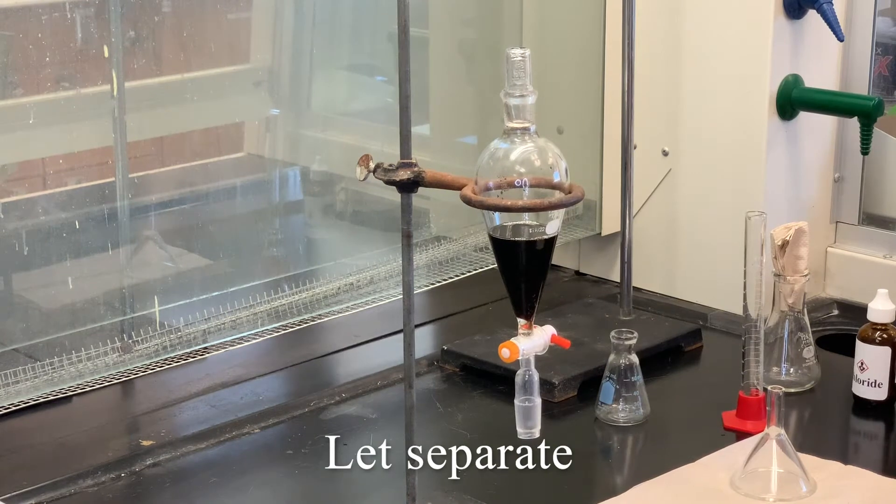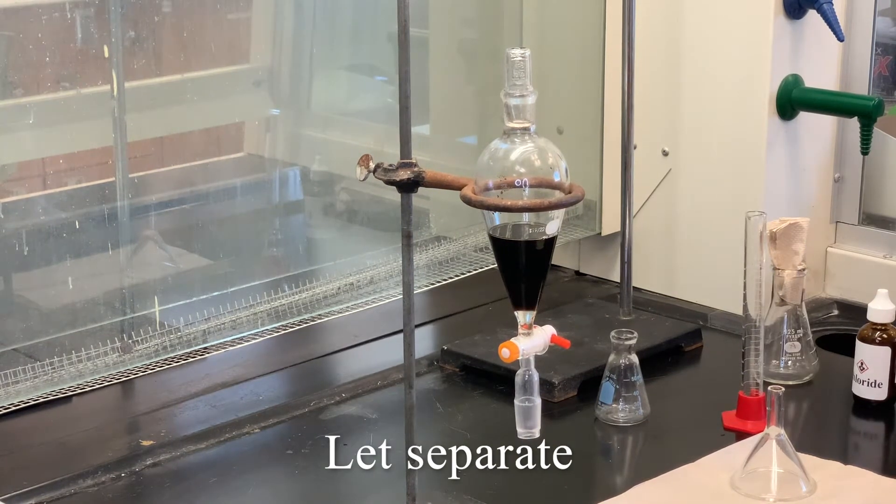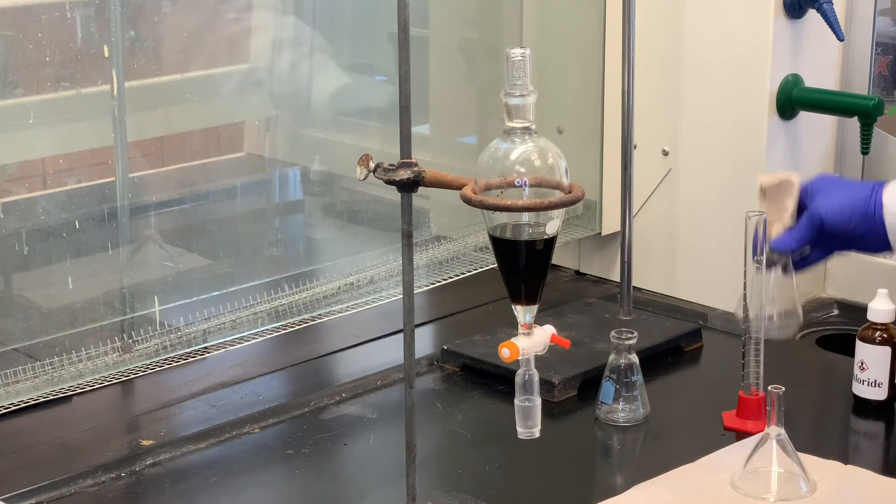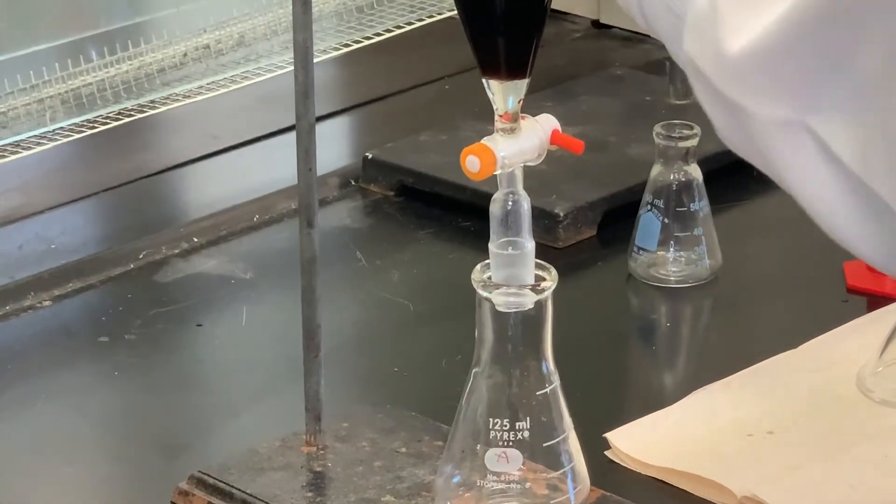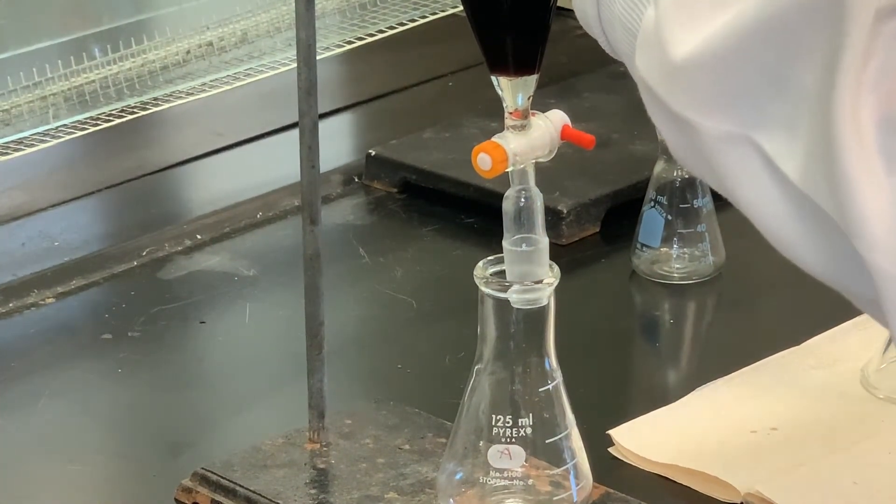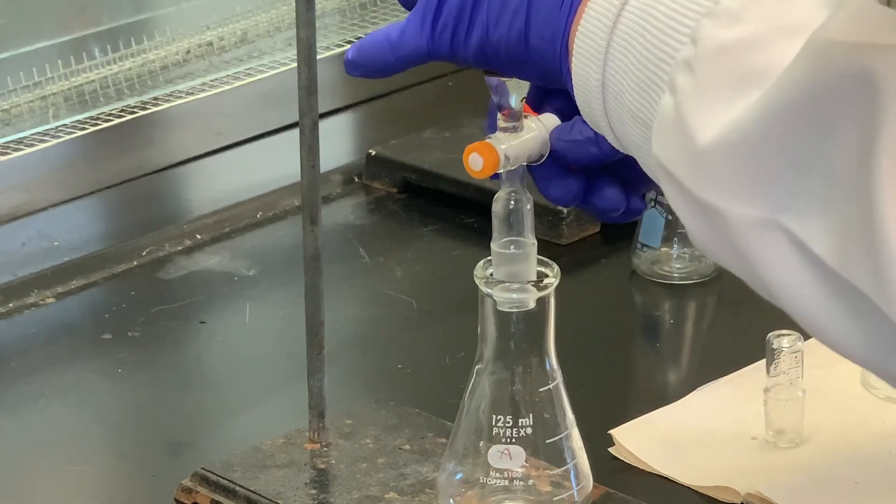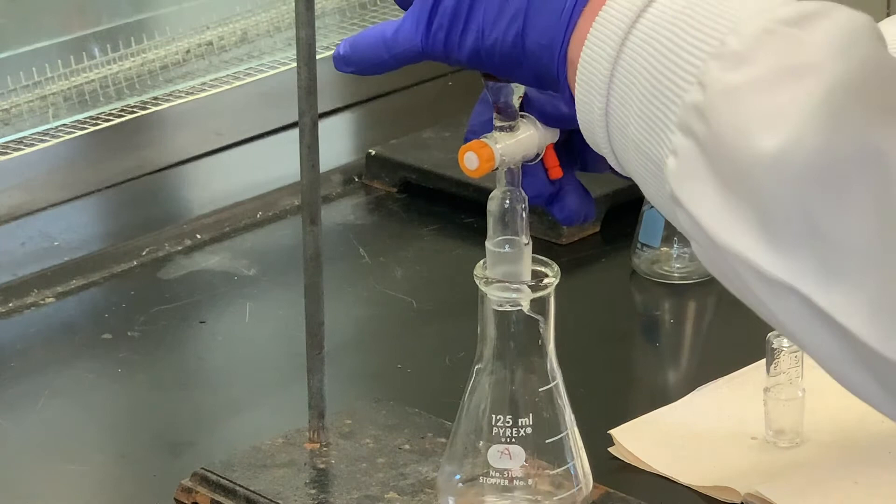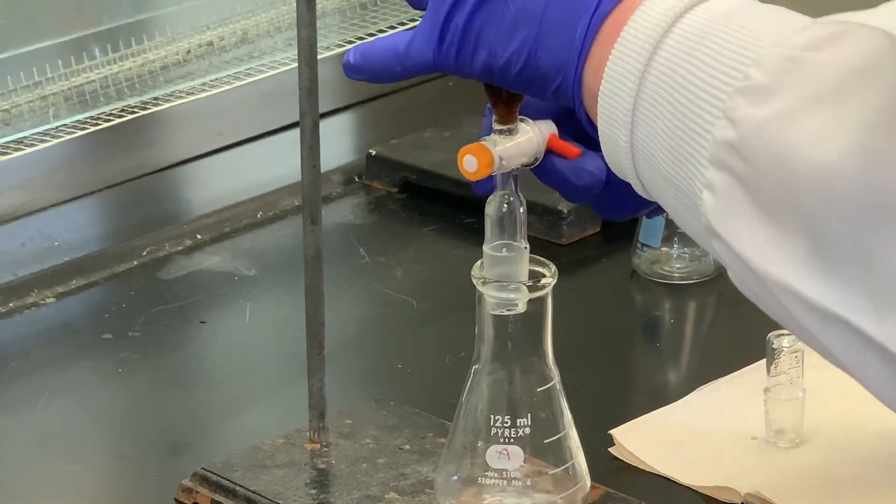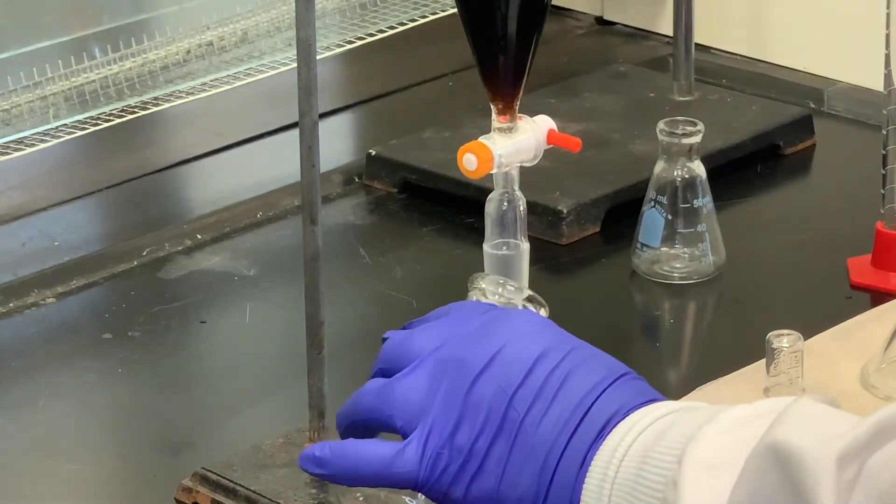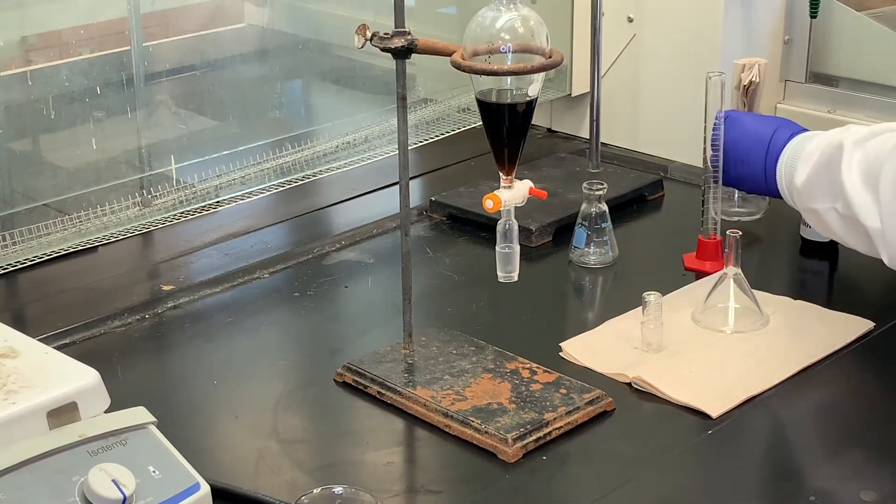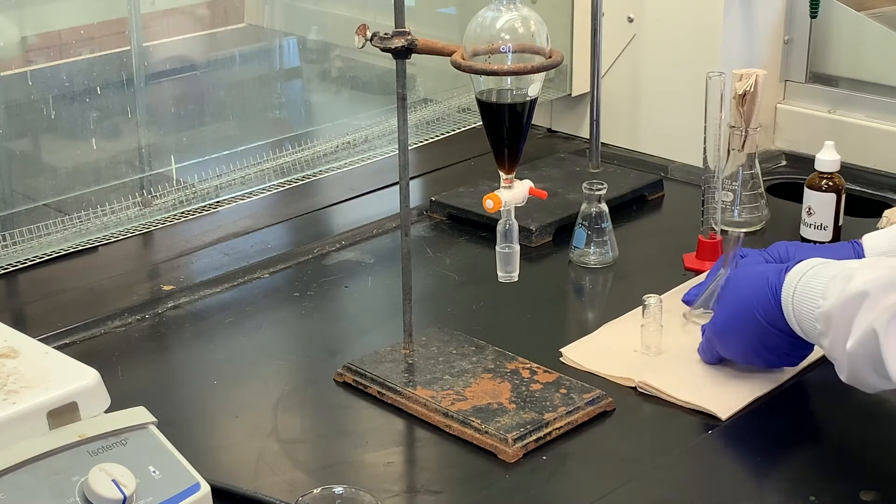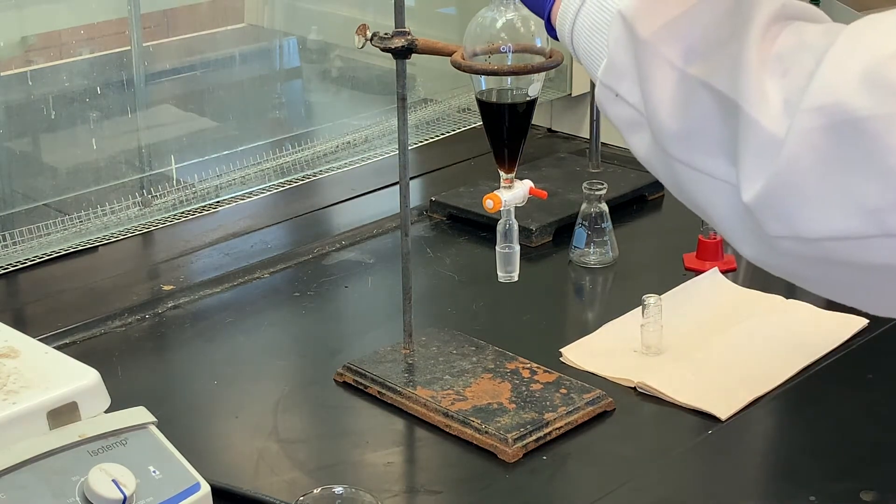Let that set so the layers can separate again. Looks like separation has occurred. I'm going to collect this material in that same Erlenmeyer flask I used previously. Remove the stopper, and then drain that. Notice that I left just a little bit of that methylene chloride solution there. I'm going to add another five to ten mils of the methylene chloride.